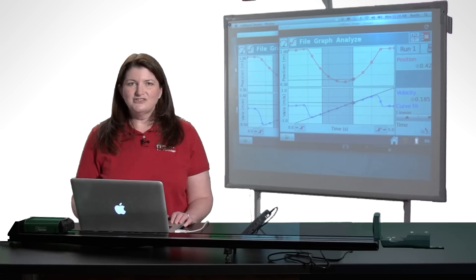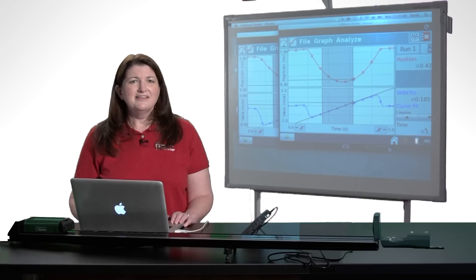The LabQuest viewer allows you to do demos, allows students to share their data, and allows you to do screenshots. I think it's a very important tool to have in your laboratory.